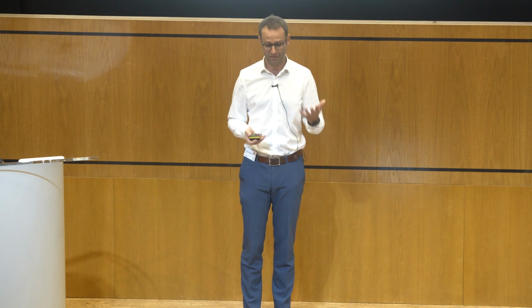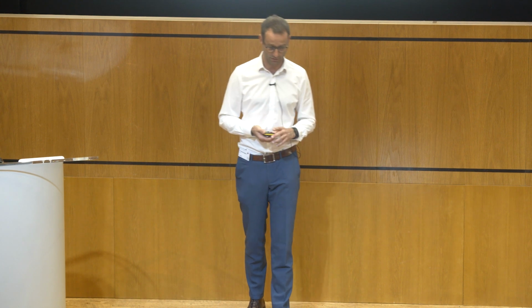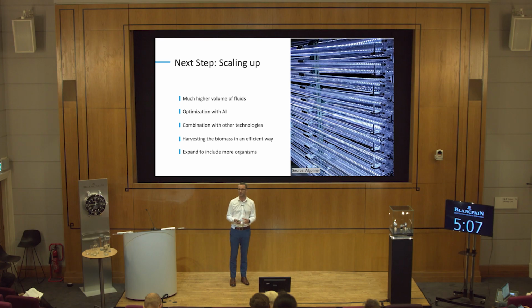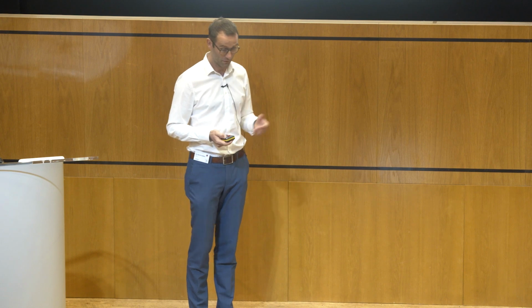We further want to optimize the process, collecting the data right now using our AI algorithms. We think about how we can combine these kinds of bioreactors with other technologies like CO2 capturing machines or biogas devices. How can we harvest the algae in a more efficient way? And right now we work with algae, but you can also expand it to other organisms like E. coli, bacteria, for example, to produce tensides or other materials we want to have.